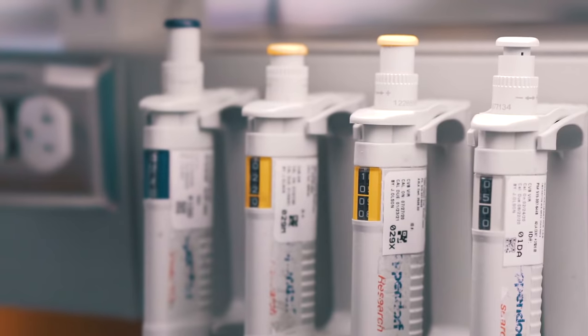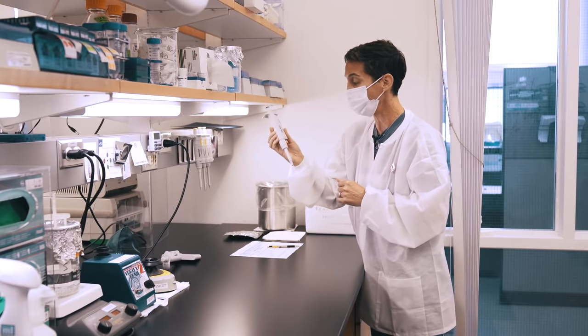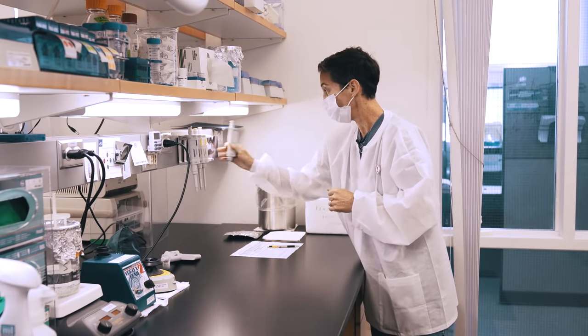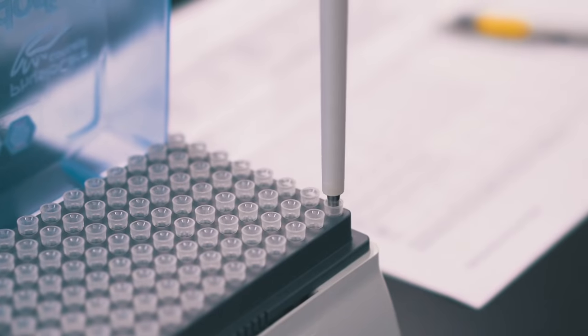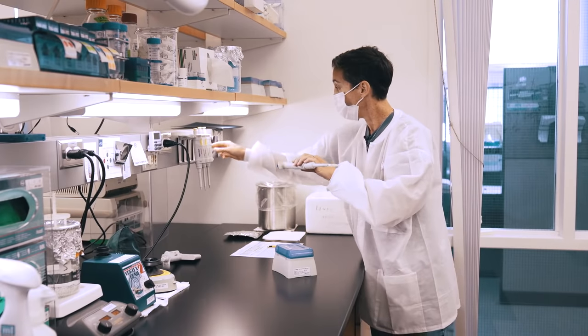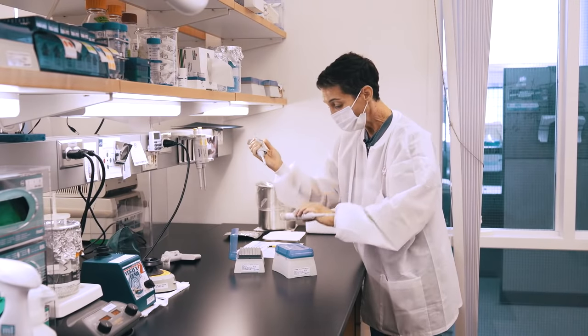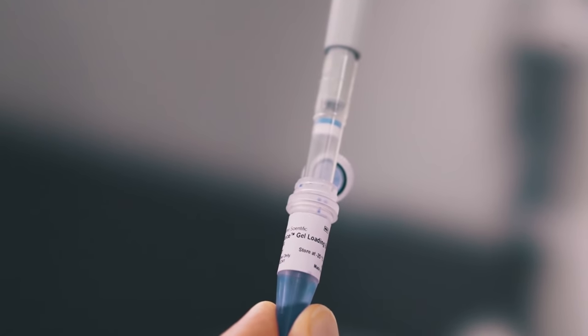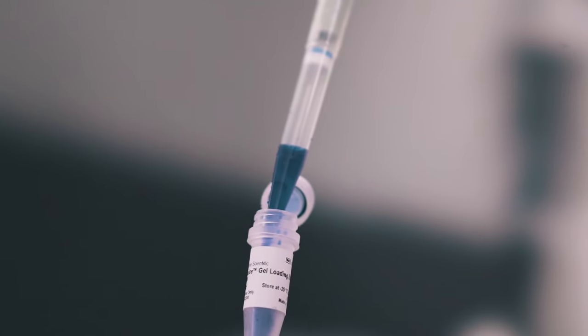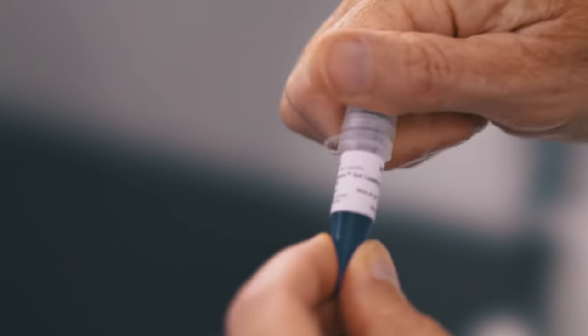So I want to show you some of the equipment that we will be using today. First, the primary pieces of equipment are the pipetters and we have pipetters that range from one mil volumes down to one microliter volumes and they use different sized tips depending on the volume that you are interested in dispensing. We use tips that are DNase and RNase free and that also have a filter in them so that reduces any splashing up onto the pipet itself and protects reactions from getting contaminated that way.